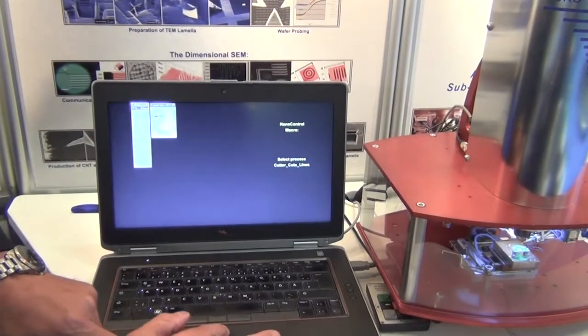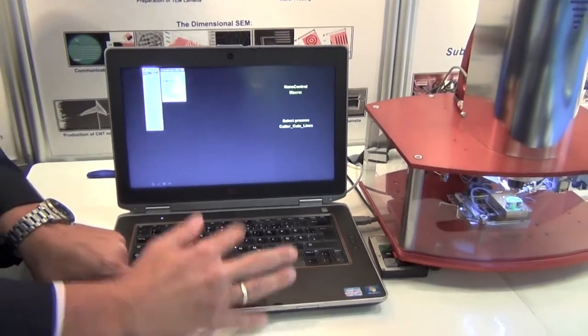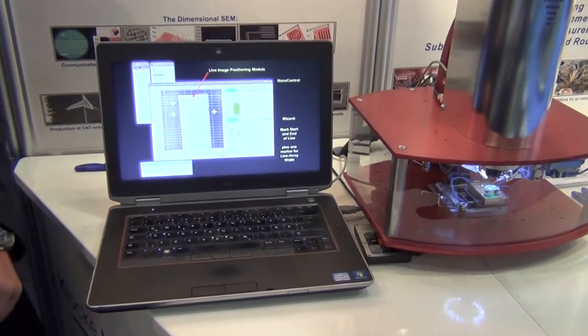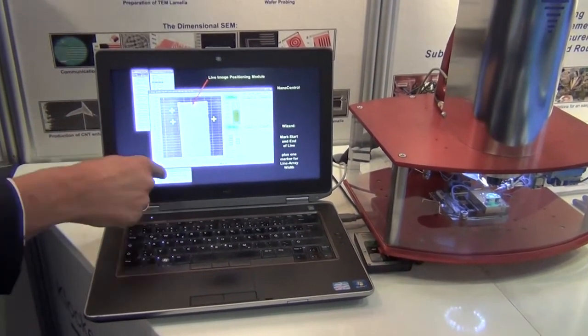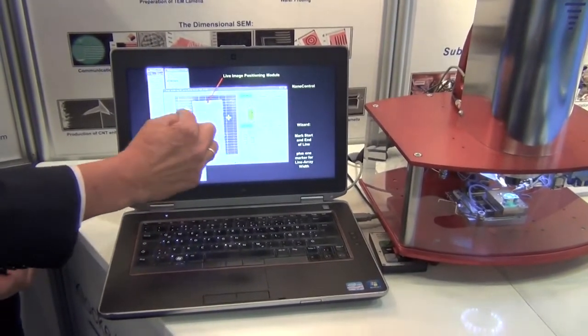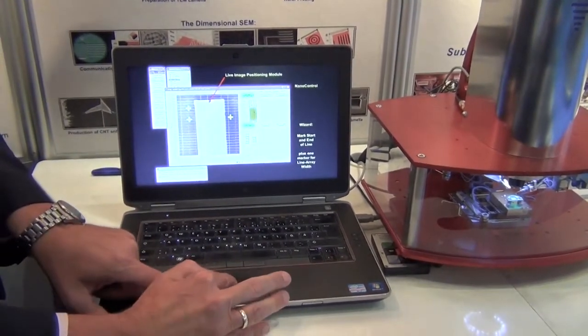And then we can take any other tool that we like, for example an electrical probe or in this case a cutter to cut lines. An assistant window opens, asking you to make two crosses to cut one line or three crosses to cut an area of lines.